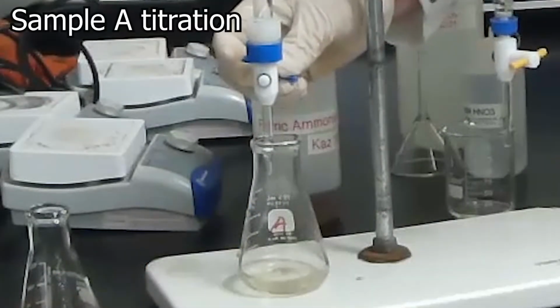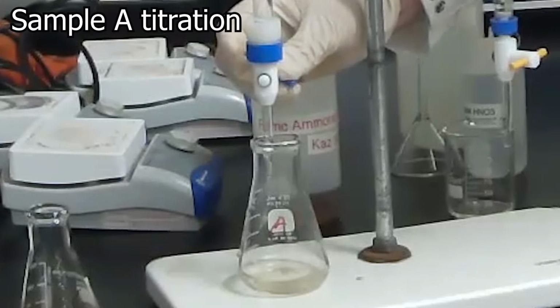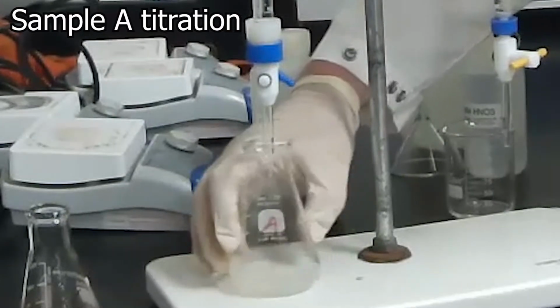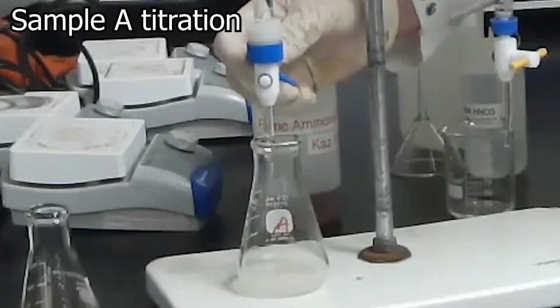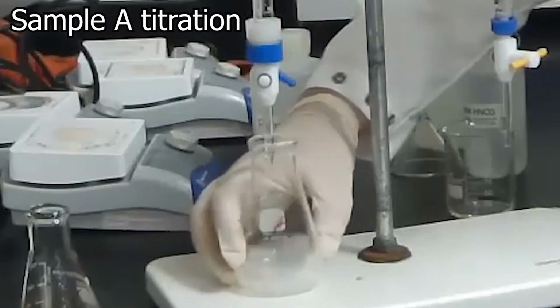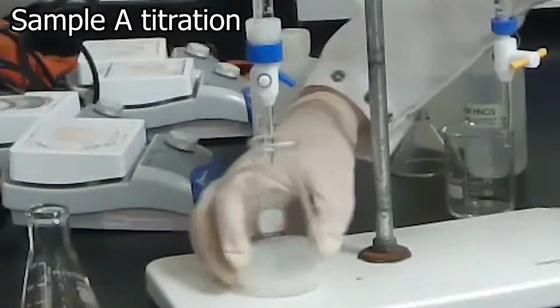You can already see the color that it's going to hold. It's going to get sort of a rusty red color when it's finished.